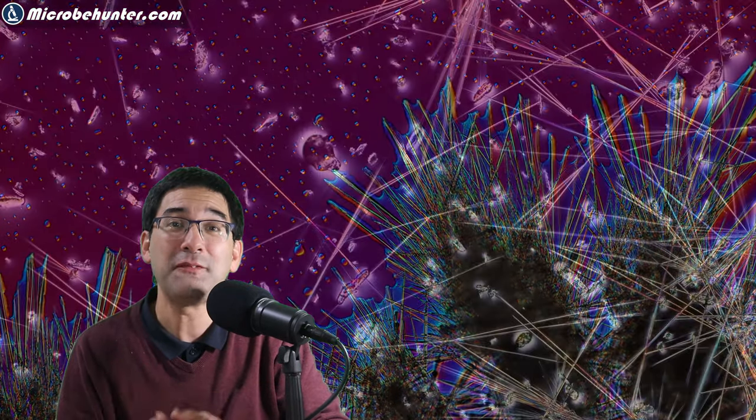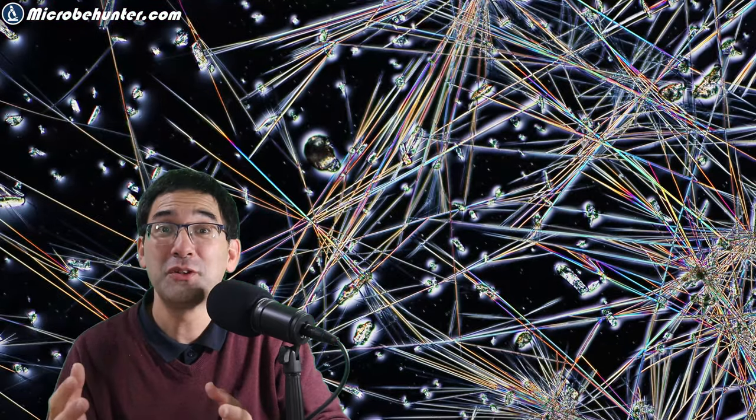Later on I'm going to talk about how I actually made this. There is a slight problem when you're using those caffeine capsules because they do not contain pure caffeine. Of course you might wonder, is it possible to use coffee and crystallize the caffeine? Maybe not, because there are so many impurities in coffee and the concentration is not very high. But also those capsules are not pure caffeine.